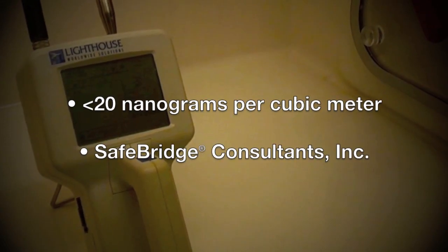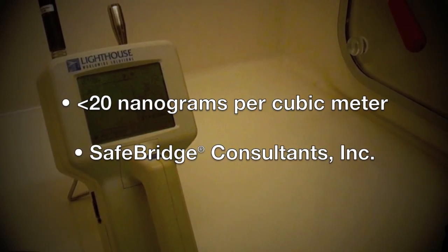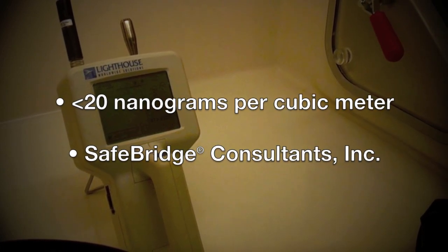Protector filtered glove boxes have also been particulate challenged showing containment down to less than 20 nanograms per cubic meter, with surrogate particulate test using naproxen sodium, confirmed by SafeBridge Consultants Inc.